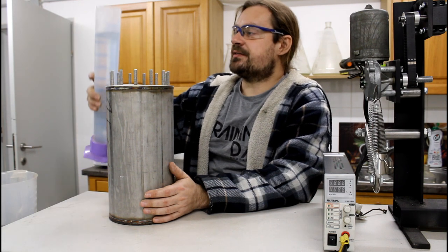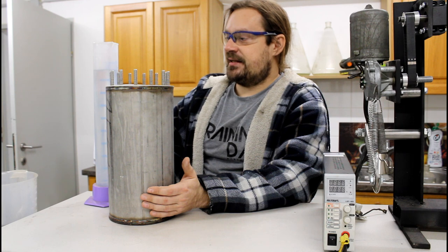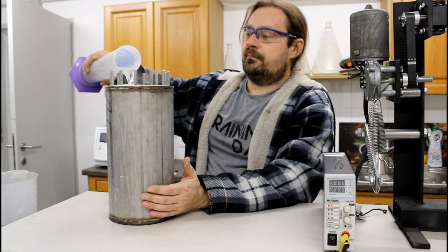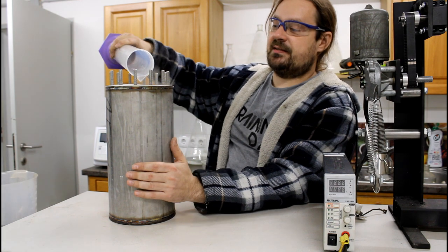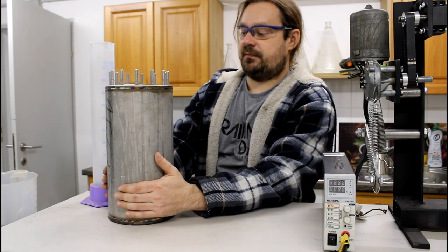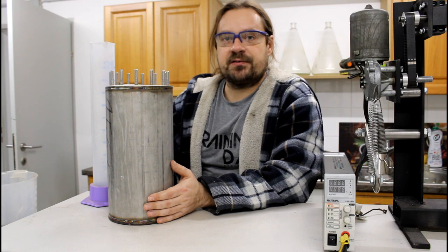So now this is already prepared, it's water. I don't use distilled water because it doesn't make any sense here, because anyhow there are so many different metals and substances inside that it doesn't need to be distilled water. So now we are pouring the water inside. I'm feeling already that it's heating the stainless steel chamber up, because what's going on is an exothermic reaction, meaning when the lye dissolves, it creates heat. So it's already pretty hot. Okay, so this step is finished, and the next step will be to connect the reflux condenser and to start the boil.